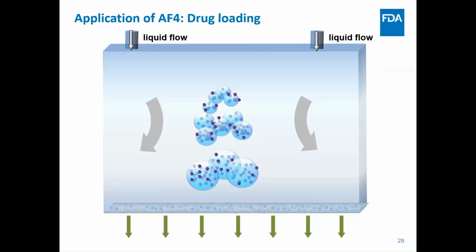So far we talk a lot about the particle size and the structure of the formulation. But in a lot of cases, if we use a nanoparticle, liposome, or solid lipid particle as a drug carrier, we know not all of the drug is actually loaded inside the carrier. Some may be dissolved in the solvent. Some may be loosely bound to the carrier. So in that case, we want to know how much is loosely bound and how much is firmly loaded inside the carrier. And by using AF4, we can study that matter.